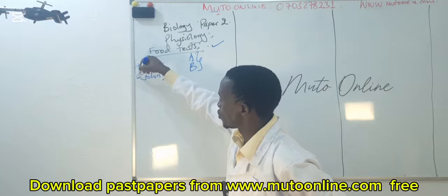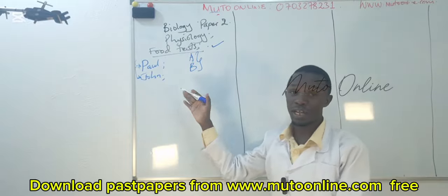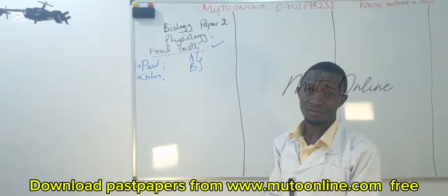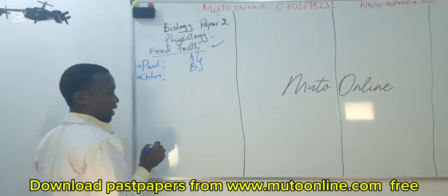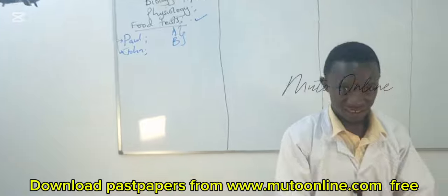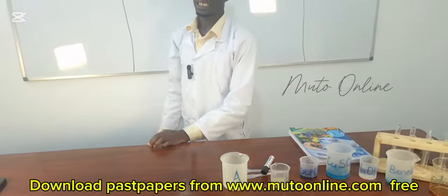He has approached you for help, so you are going to do the needful to help James. We are going to call out food tests on these, in line with solving the problem stated in the scenario.